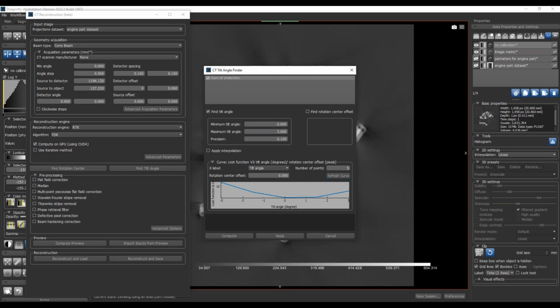Okay, here we see a local minimum between 0 to 1, should be something like 0.2 or something like that. That's gonna help you again to use a smaller range. Because we know it's something between 0 to 1, we can change this to be -1. And this way the optimization will be faster. But anyway, because this method is only done for the projection domain, so there's no reconstruction involved, itself is already very fast.